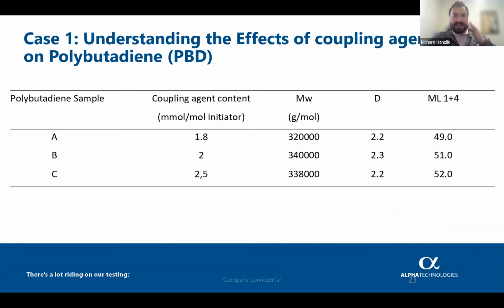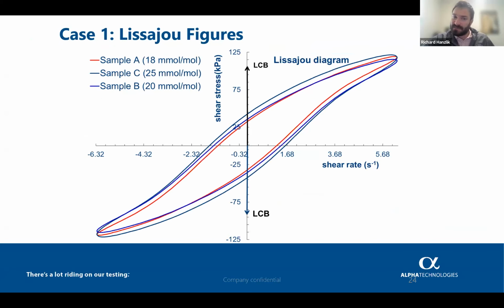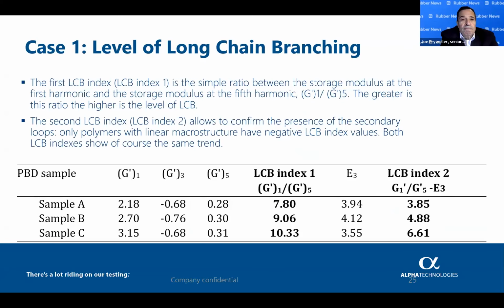So the subtlety in, are we asking what's the sensitivity? The subtlety of the variation detection. I'm not sure I completely understand the question. Basically, I think the question is what's the minimum detectable level? Yeah, that sounds right. Okay, so in this case, we see coefficient of variations of less than 1 to 2%. So depending on what the material response is to that coupling agent is going to indicate whether or not this method is going to be able to detect it.